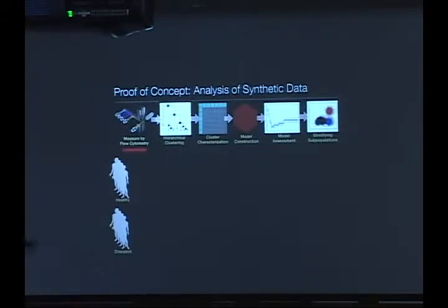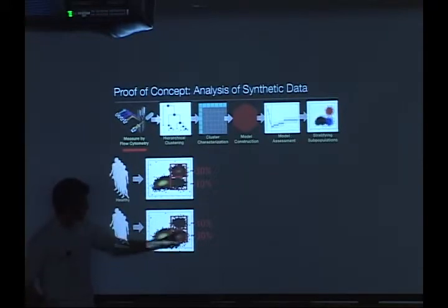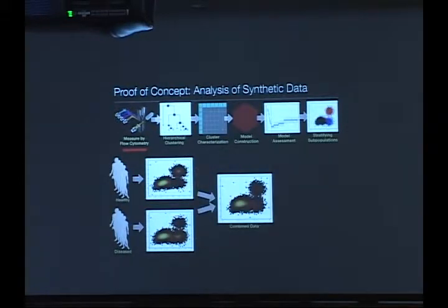So here, again, now I'll show you the synthetic example. We have a bunch of healthy patients, a bunch of diseased patients. We have their 2-dimensional data. 10% of their cells in the diseased patients are up here. 30% of their cells are in this bottom population in the diseased patients. And again, that's flipped between our healthy and diseased patients. There's noise in this, but that's not really the point.